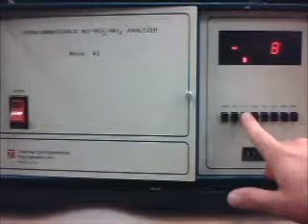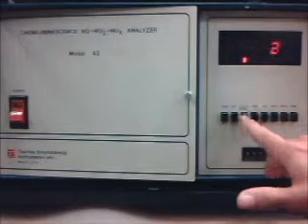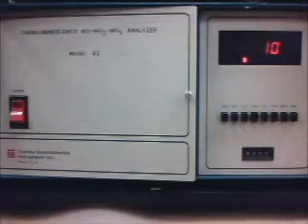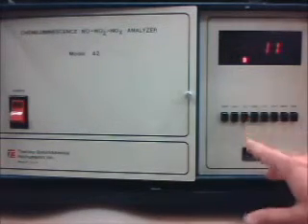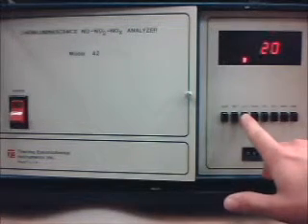Once we stop it, we can stop it at any point. I don't know why it starts at minus 23. It just does. Anyway, let's say we want 10% of the full value, so we stop it at 10%, let it run for 3 to 5 minutes, and then we start it back up again, and it'll just keep going, and we can stop it whenever we want to. So let's say 20%, and we can just continue this up.